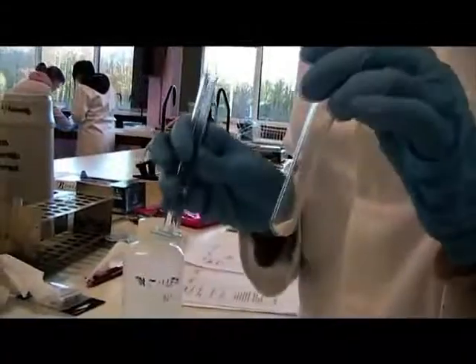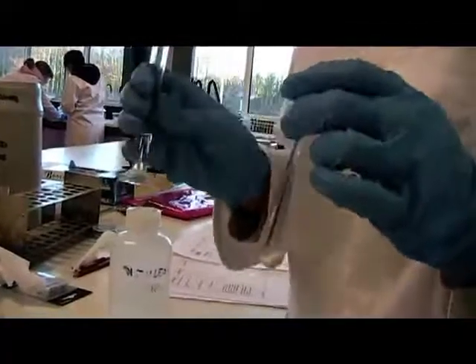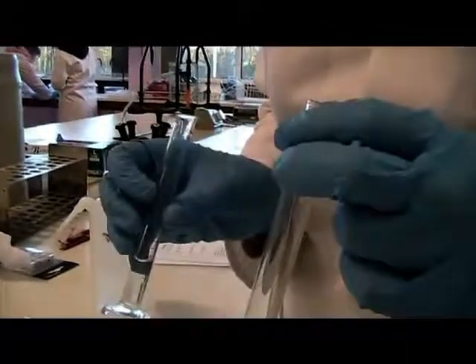So now we're going to decide if it's a carboxylic acid or a phenol by adding sodium carbonate, and if it is a phenol, it may dissolve, but there will be no fizz. But if it's a carboxylic acid, it will dissolve and there will be some effervescence.